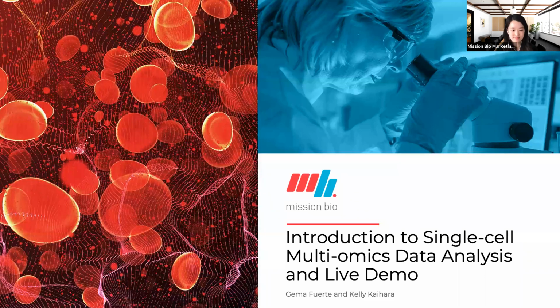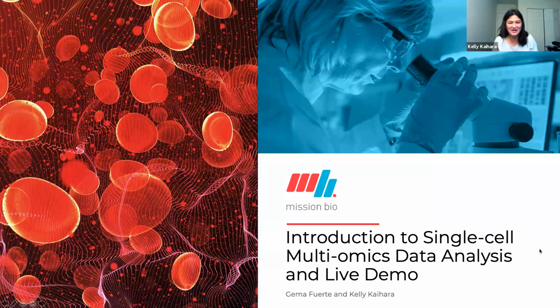Hi, thank you, MJ, and thank you everyone for attending. We're really excited about launching our new multi-omics capability with a commercially available kit in conjunction with BioLegend.